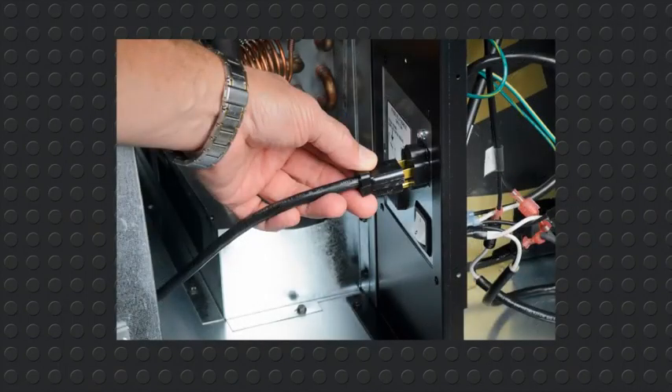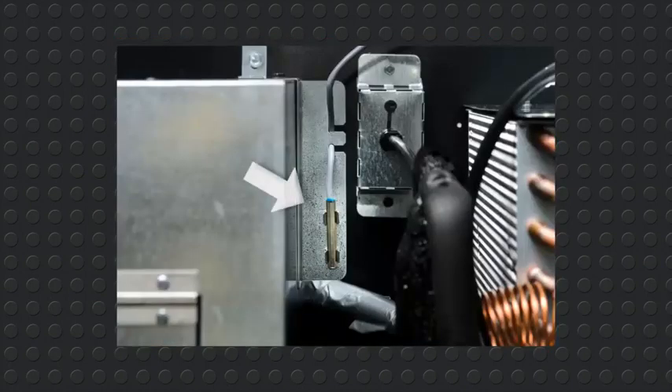Unplug the chiller above the on-off switch to the right of the fuse box. Remove the temp sensor hooked on the bracket on the right side of the chiller housing. Disengage the probe from the two clips holding the sensor in place.